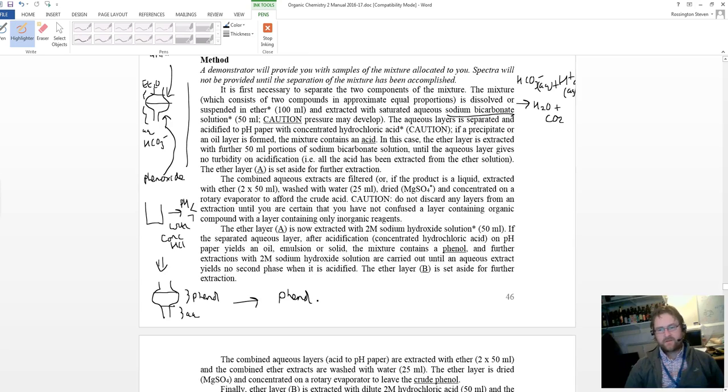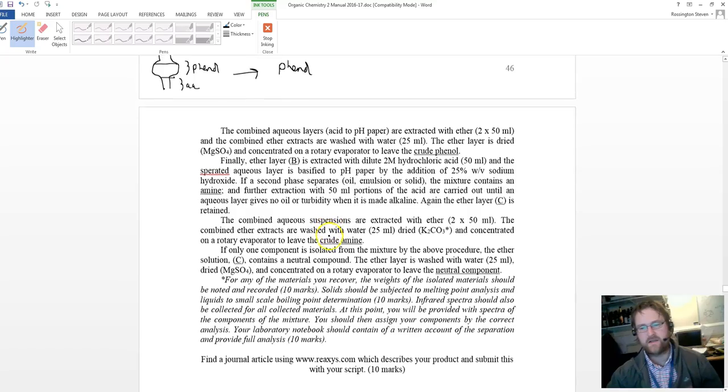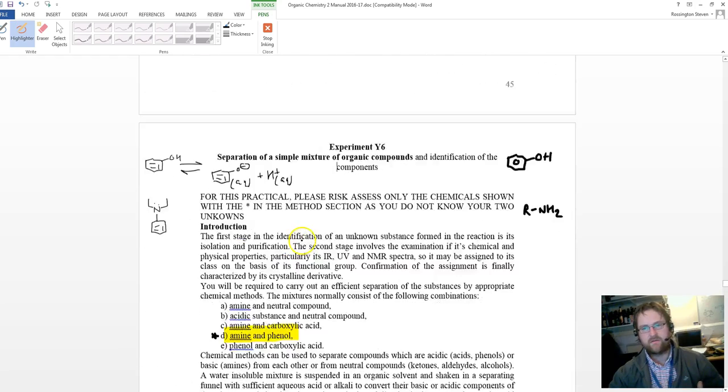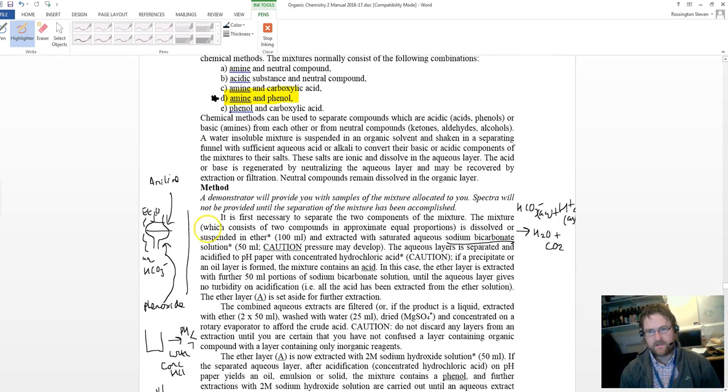So this is a sheet which has a few layers put inside of it to say how to deal with the various scenarios. But because I told you, well, we have an amine and a phenol, you ask yourself some of the chemistry of this system. The phenol can form the phenoxide and H+. And at that point, once we have the phenoxide ion, in this initial part here, the bottom layer, or the aqueous layer, contains the phenoxide.